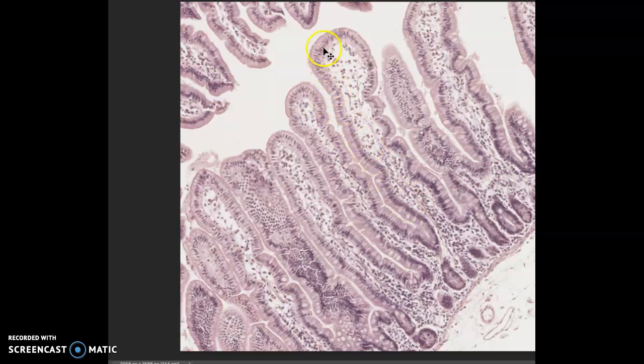So here are the villi. It's the submucosal layer. And these are the pretty goblet cells. So that's what you would be labeling on these. So thank you.